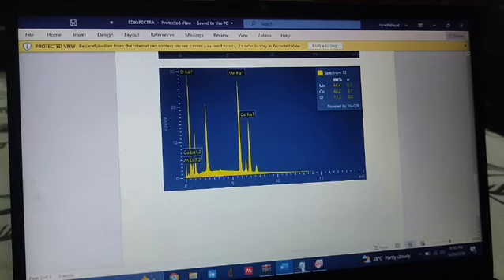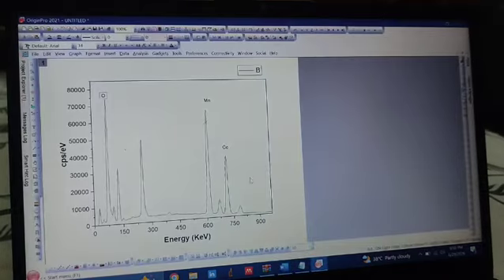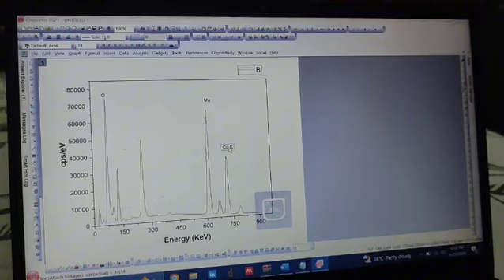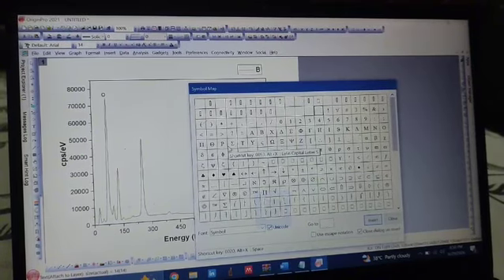One important thing to mention is to also mention the electron shells like K, L, etc. from which the emissions occur. This information is also available in the original graph.